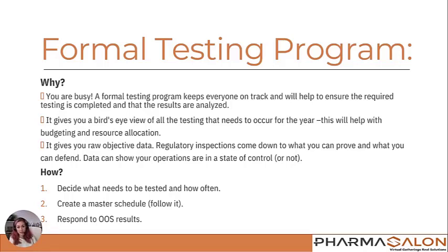It's going to give you a bird's eye view of all the testing that needs to occur for the year, and that's going to help with budgeting and resource allocation. It's also going to help ensure that you have that raw objective data. Regulatory inspections really come down to what you can prove and what you can defend. This data can show that your operations are in a state of control or potentially not, which if you're not in a state of control, you absolutely want to know that so you can get it corrected.